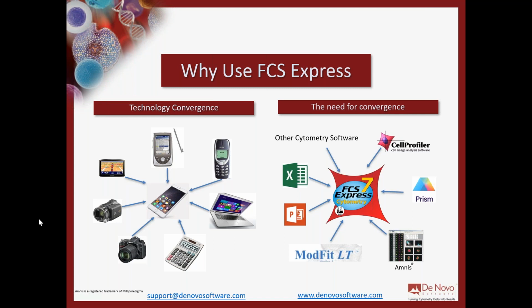There's all these kind of tools that folks generally need to perform analysis. And what we do in FCS Express is we bring that all together. So imagine having the power of Excel directly related to your gates, the power of Prism directly related to your samples, things like PowerPoint, cell cycle modeling, and really all of that is wrapped into FCS Express. So literally as you move a gate, all that kind of downstream analysis gets performed in the software.